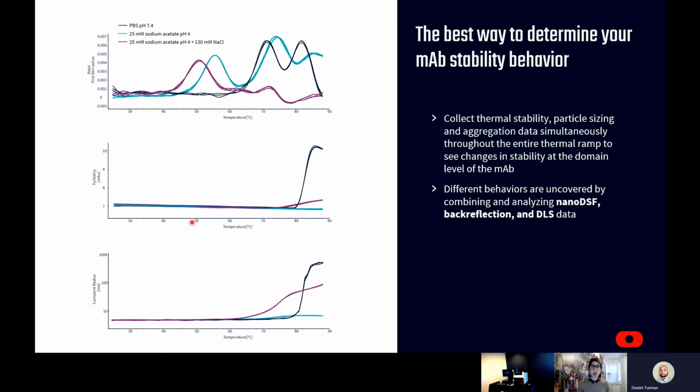And then with the addition of salt to the sodium acetate buffer, shown by this purple plot here, we can now differentiate 3 unfolding transitions, which all shift to lower temperatures. There is the subtle formation of amorphous aggregates, shown by the turbidity plots, which occur concurrent with the 3rd unfolding transition. And then oligomerization also occurs, but that is more occurring at that 2nd unfolding transition about here.